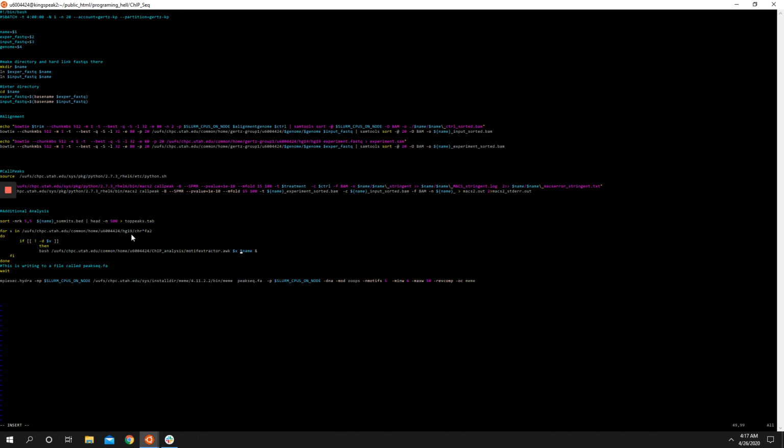I'm sorry, this program, I wrote it a while ago and it's kind of goofy, which is why I'm a little confused about how it behaves. Okay, so it's actually looking for the folder that it needs to write stuff to, and we're just going to say write it to this folder. That's what the period means. It's just the folder we're working in at this moment. So yeah, we're just going to put that in there.